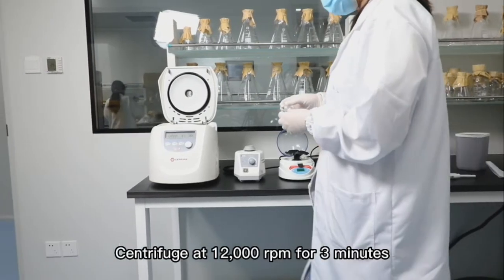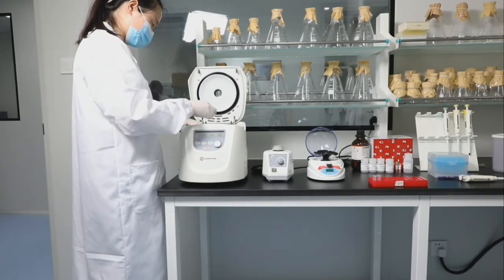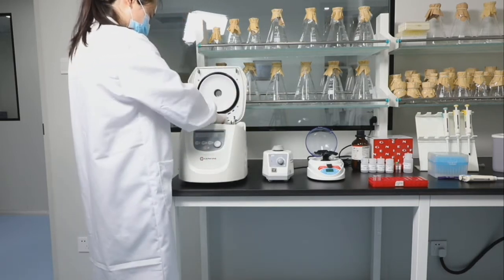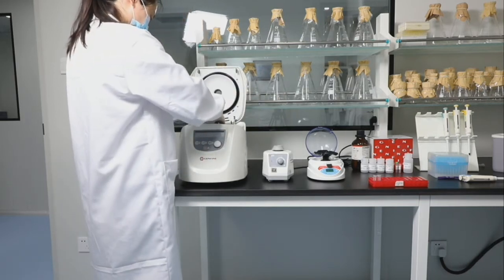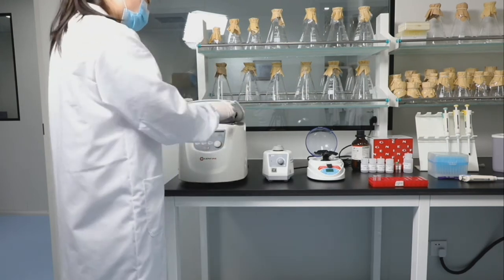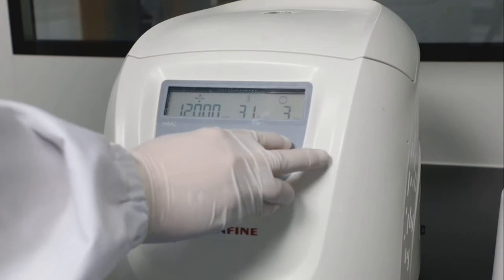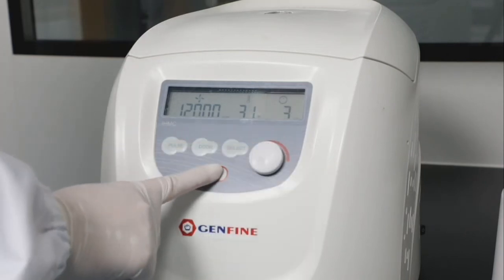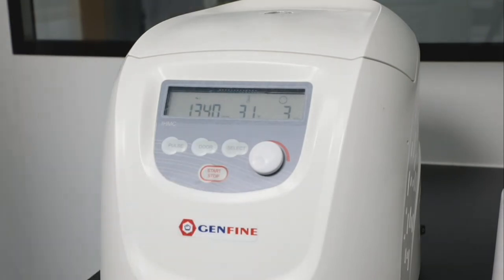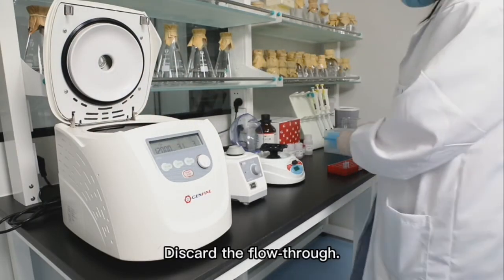Centrifuge at 12,000 rpm for 3 minutes. Discard the flow-through.